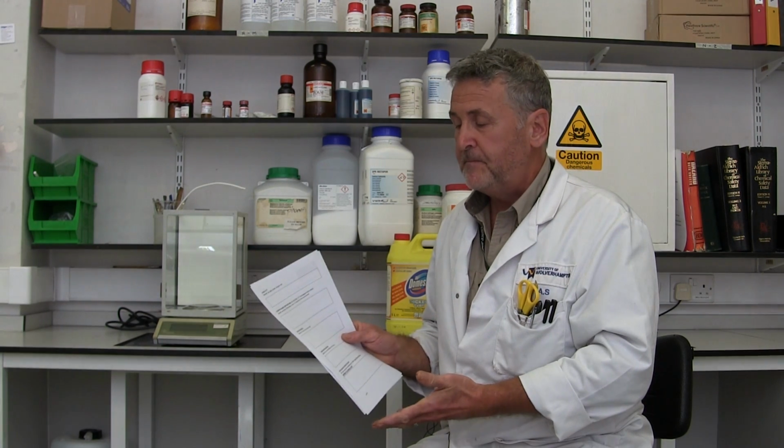So now, having Googled your substance or your chemical, you can then begin to fill in the sheets. Now I'm going to quickly run through these boxes, and you will find that in this particular video there are still shots of the sort of thing we would expect you to fill into the box, something simple. If you want to put something more complicated and really write out some detail because it applies to your project that you think we ought to know or you want to remember, that's fine. You can do that. But simply avoid writing the huge lists of things that you'll find on the CoSHH data form sheets that don't apply to you.